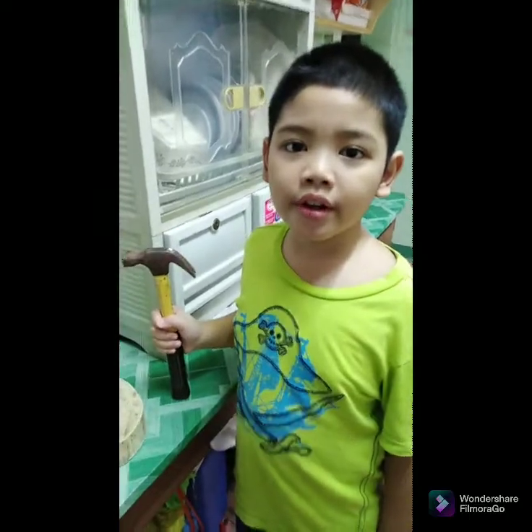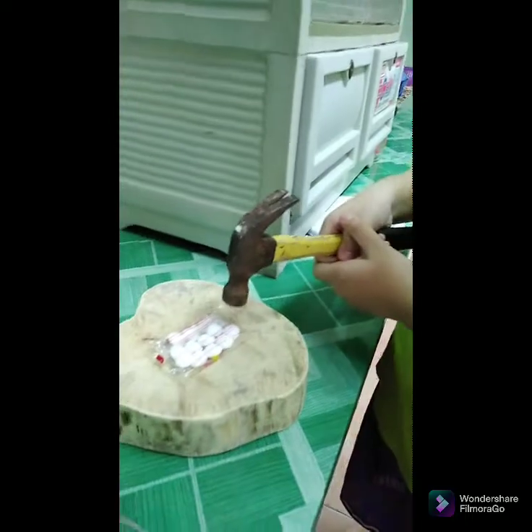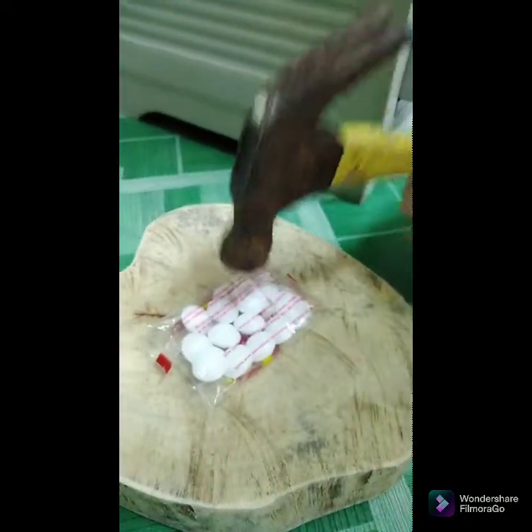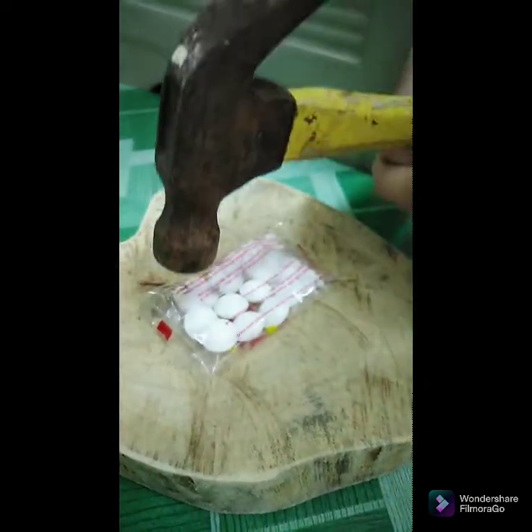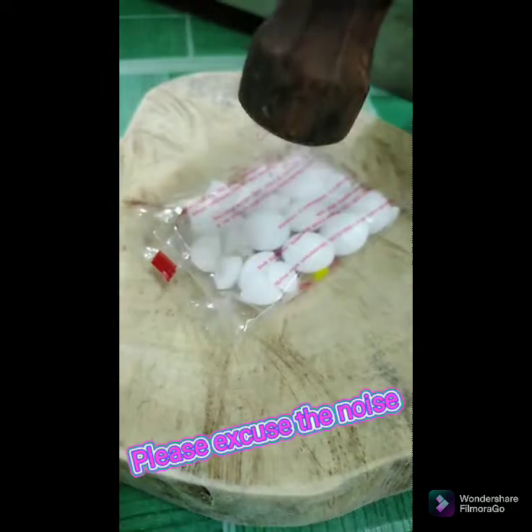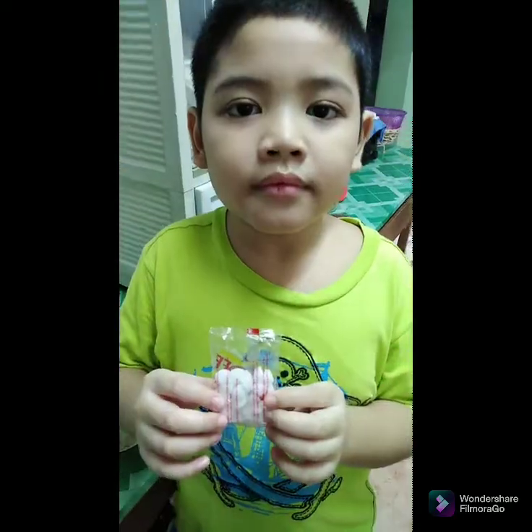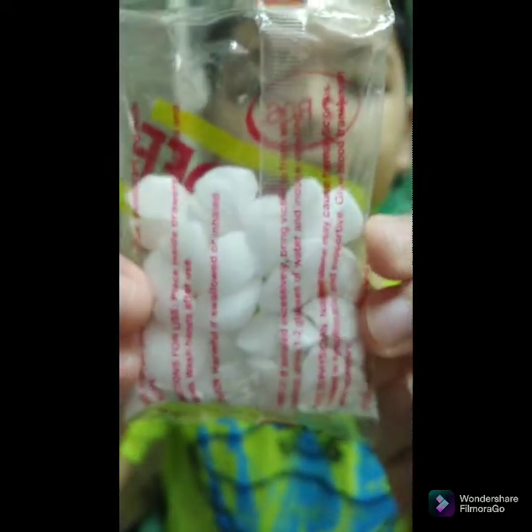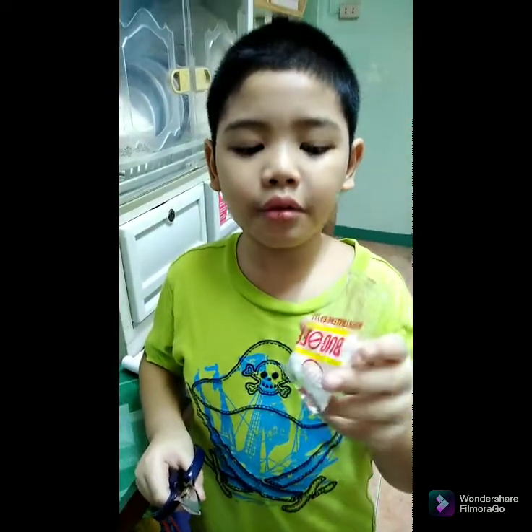We are going to smash the naphthalene balls into small pieces. Now it turns into small pieces. Now we are going to divide this into two.